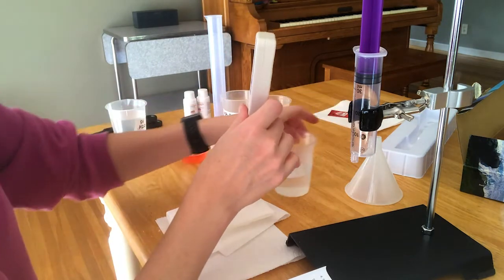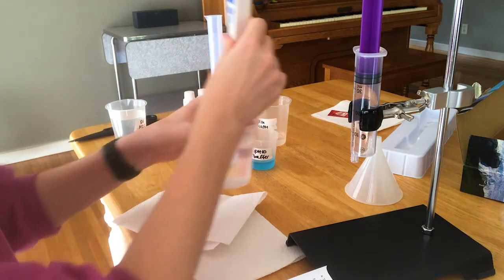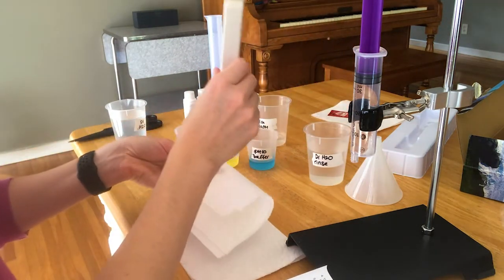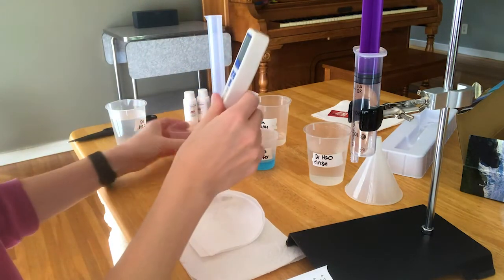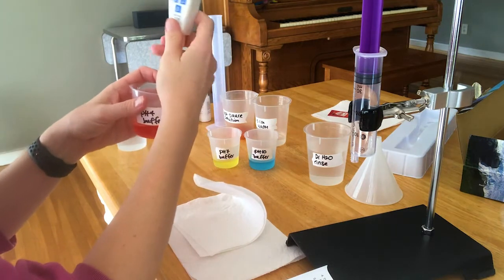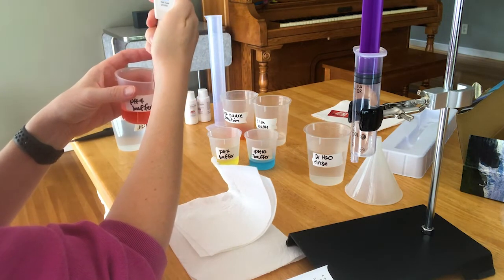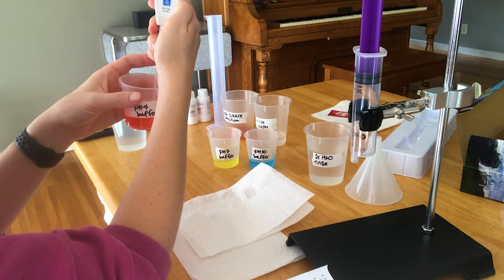In between solutions, make sure you rinse it off, dab it gently, and wipe off the outside. Then we're going to use the pH 4 buffer. Once again press calibrate — it'll say 4, then it's going to say SA, and when it's done it'll say end.